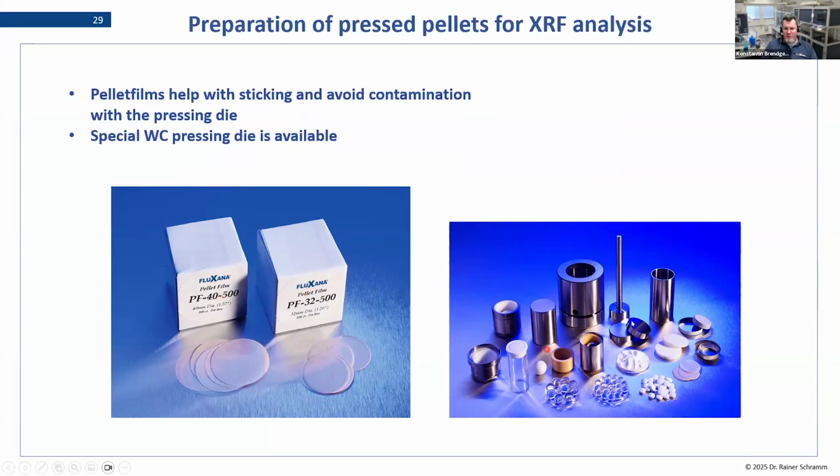And yeah, we put them on these little plates that then go in, and they avoid sticking and contamination. I mentioned before the iron in the silica oxide that the glass industry had as a problem. We tried to avoid them with that, but it was actually not enough. So we only had the help with the sticking problem, so to say.